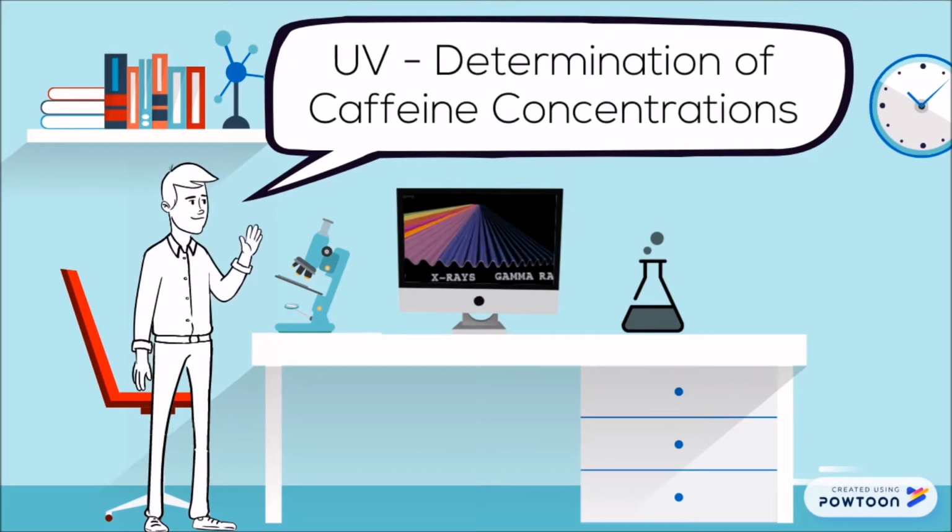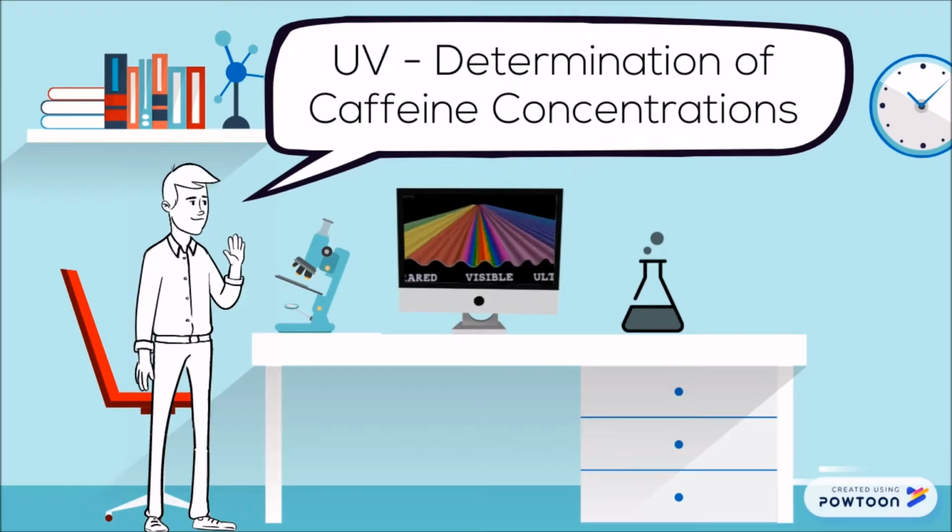In this video, we'll be discussing the determination of caffeine concentrations by using UV-Vis.